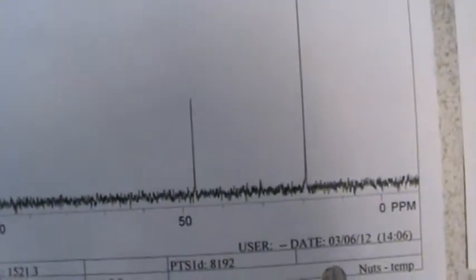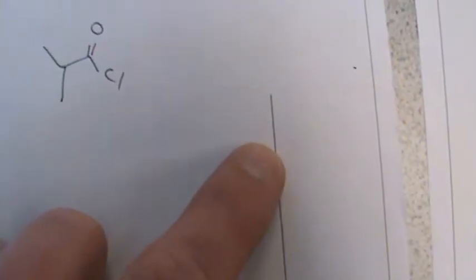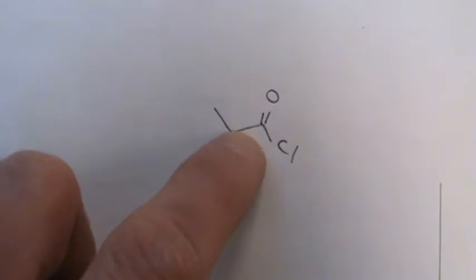When we look at the carbon of isobutyryl chloride, we've already done that. The tall one here, the two methyl groups, this is the methine carbon right there in the middle, and then the carbonyl carbon out at 177. We go on to our product, which is isobutyramide.